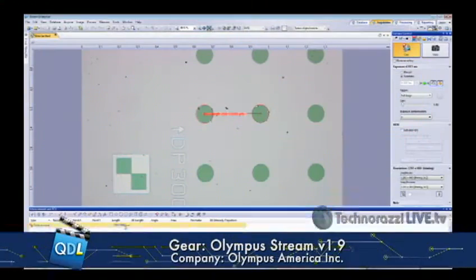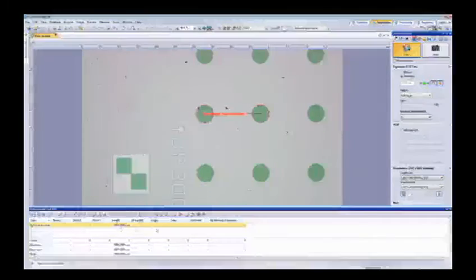Showing the length right on the image, and all of these manual measurements can be exported to a workbook, then out to Excel, or embedded into reports, transferred right into your PowerPoint. So it's storing this also onto a table in the software right down here. Okay, yeah, so your features pop up down there. Okay. So we also put in a new angle ruler. This allows you to bring a ruler out onto the screen and determine specific angles of things. So that's some of the manual measurements and add-ins that we've added from feedback out in the field of use of the tool.